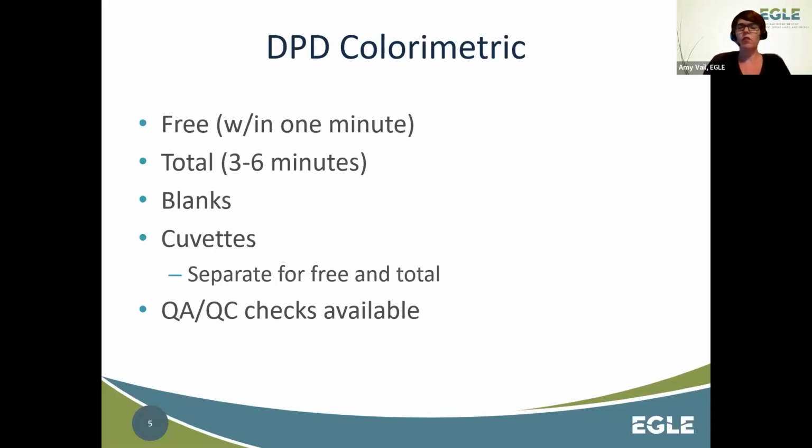There are standards that you can buy, like a 1 part per million chlorine standard that you can get. There are also little ampules of chlorine that are like 30 parts per million, and then you dilute it down and you spike a sample with that to see what's going on. So you can buy checks to check those calibrations.